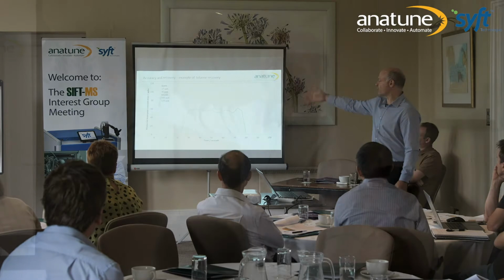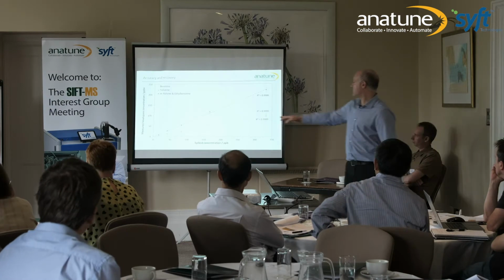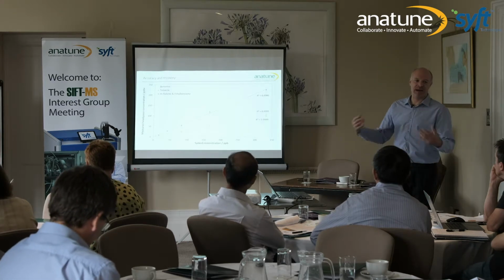That's just the result you get from the SIFT-MS, the standard injection profile that you saw yesterday and probably saw in the lab yesterday as well. And so you can see good data. And then if we look at the results, if we spike in various concentrations and we run a linearity through it, we get back what we expect and we get back in a linear way.